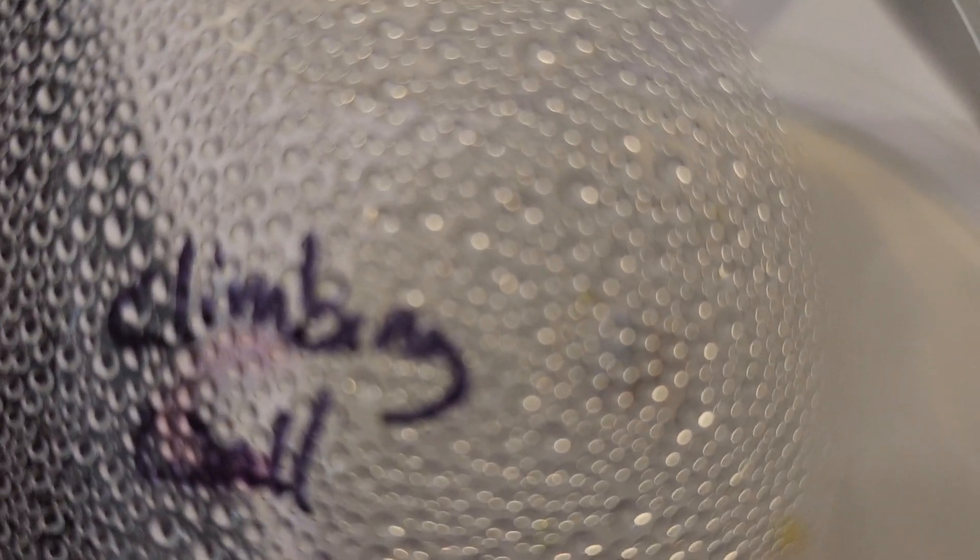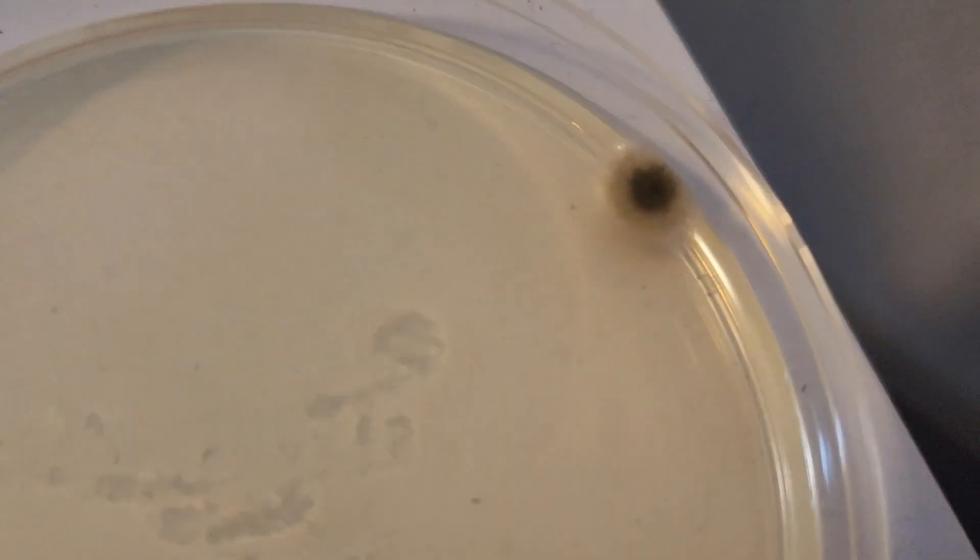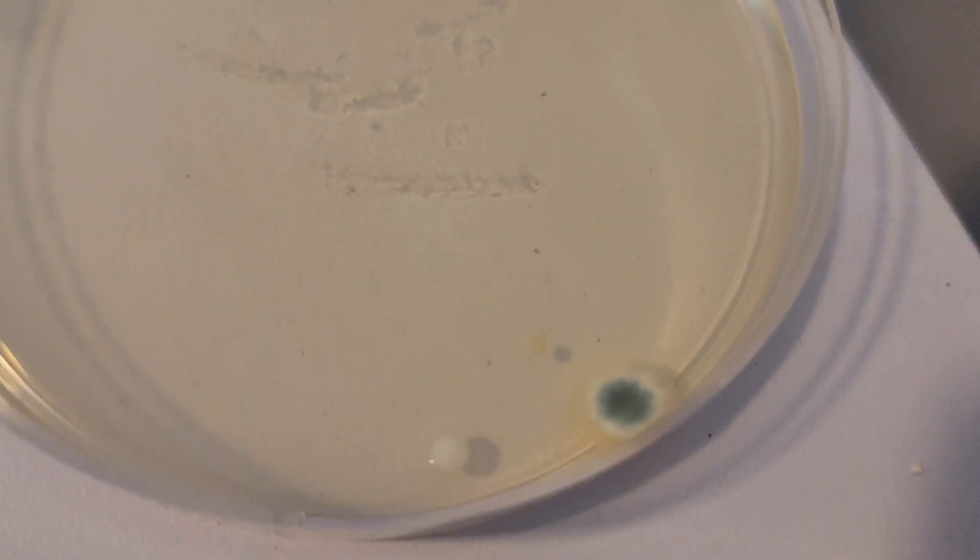It would be interesting to take these to a microscope if that's possible. On the climbing wall — here's where things get interesting — the yellow globs are emitting a slightly foul odor and the big puff in the middle is getting bigger, fuzzier, and furrier. On the gym equipment the top right puff is getting darker and there's a blue puff at the bottom that has grown quite rapidly through the night.